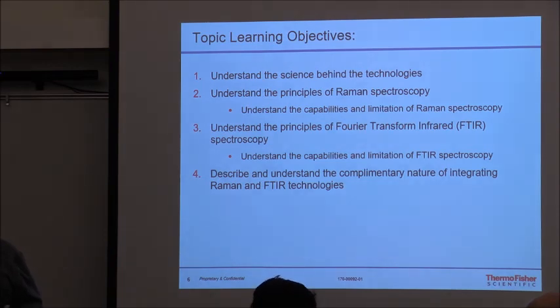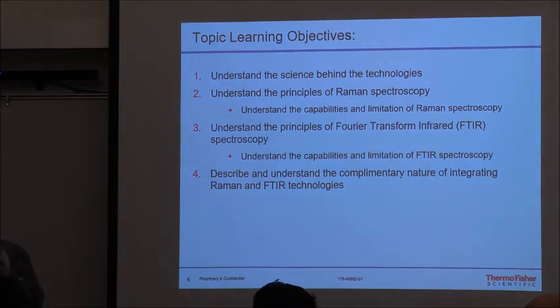The other reason that's important, remember I said, one sees things, the other doesn't see. When you look at the spectrum, the spectrums may look initially the same. When people first look at it, they're like, oh, it's a spectrum, it looks the same. But you can't really take a Raman spectrum and an FT and overlay it, because if you look at the bottom, once you see the spectrums, you'll see wave numbers, and the wave numbers are reversed. The Raman will go low, it'll go below 500 up to about 2800, but the FT rather, will start at 4000 and go down to 1000, so they're reversed. Okay? So again, you can't overlay them, they're different technologies, keep that in mind.